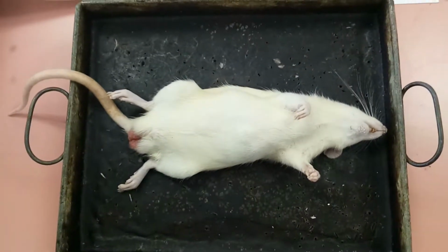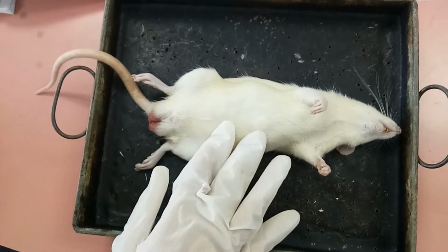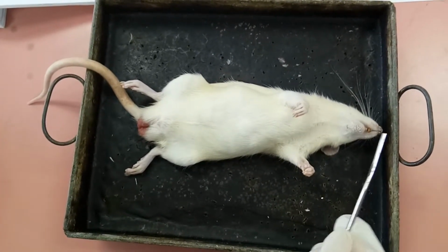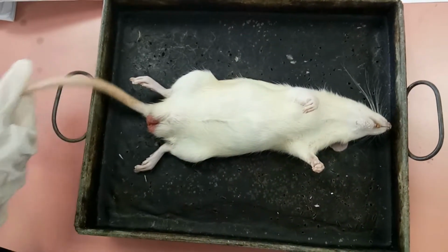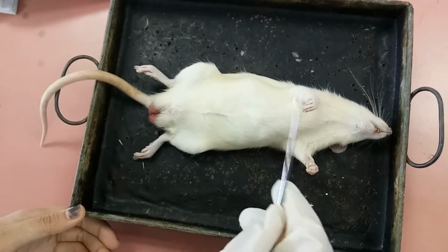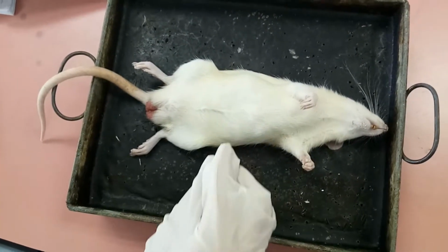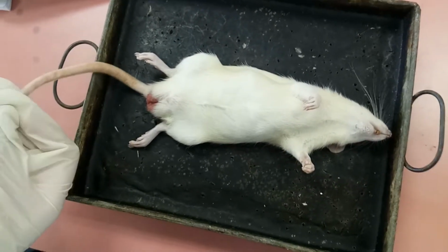For today's experiment, we are going to dissect this rat. The body can be divided into 4 parts, which are the head, the neck, the trunk, and the tail. There are 2 pairs of limbs, the forelimb and the hind limb. The whole animal is covered with hair, which is a principal characteristic of mammals, but the tail bears scales.